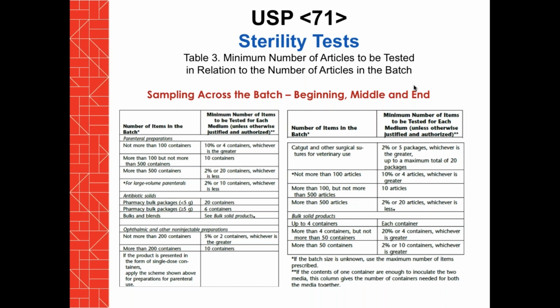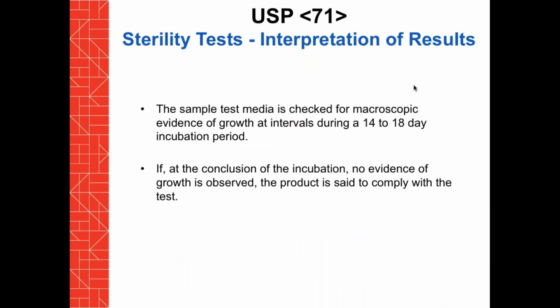Is there a potential contaminant? Is there a problem in the microbiological integrity, a breach of container integrity? One way of doing this is to sample at the beginning, middle, and end, versus having a large batch and just pulling some to meet the criteria. Do everything you can to find that error, be conservative in the approach, but sample across the beginning, middle, and end, or top, middle, and bottom.